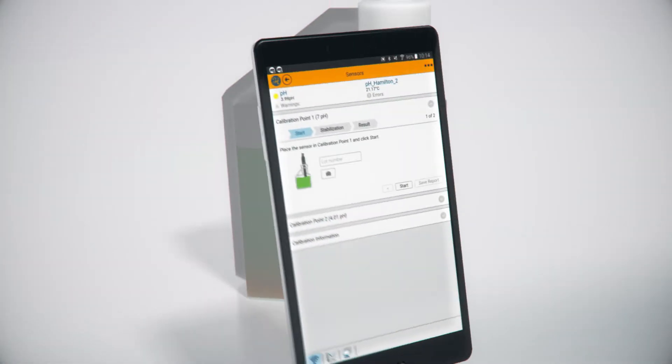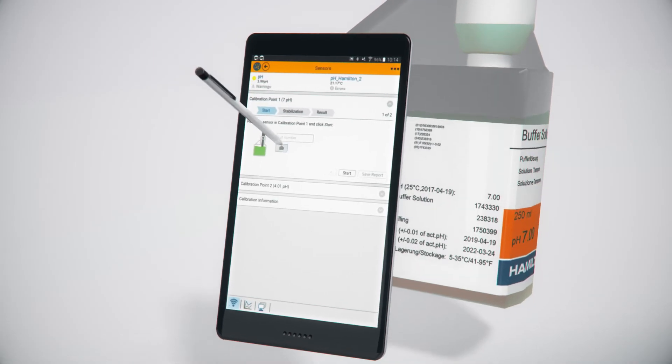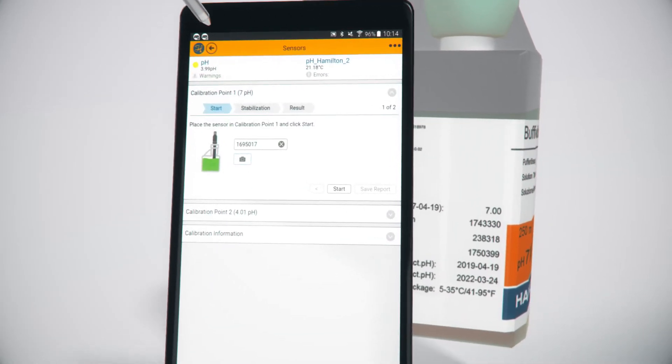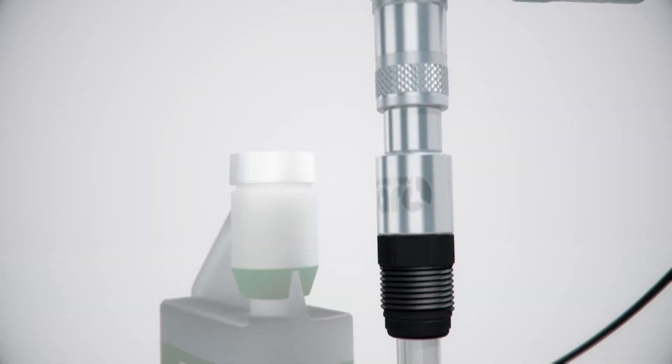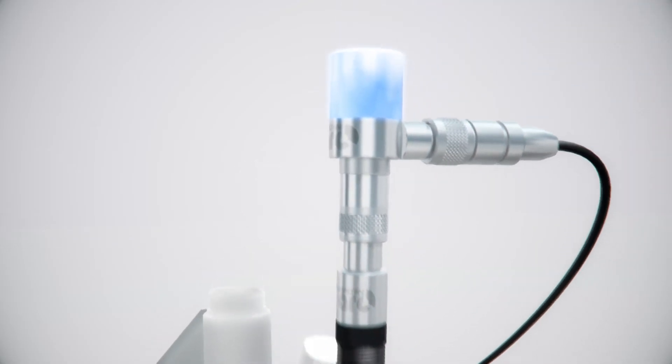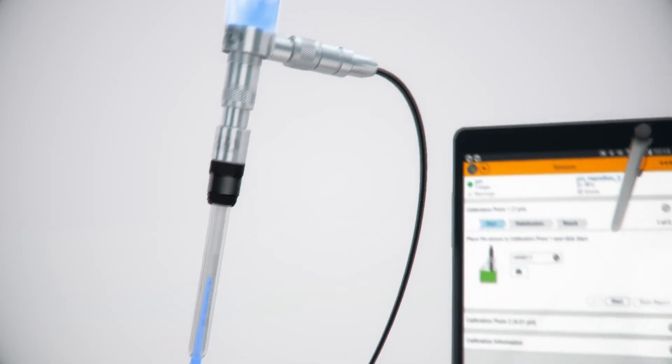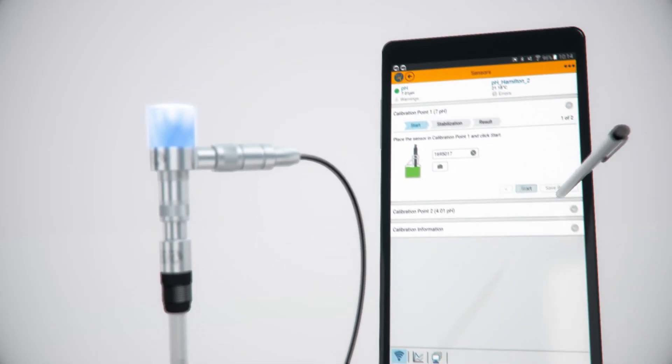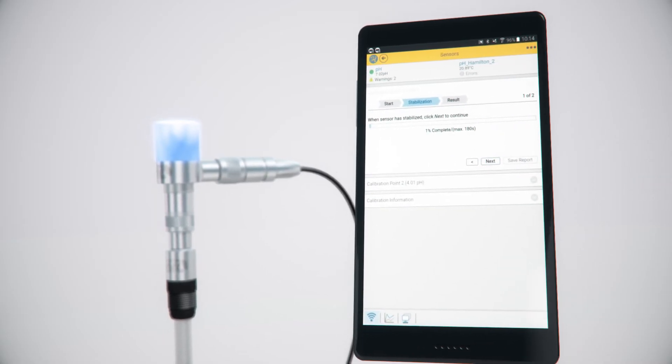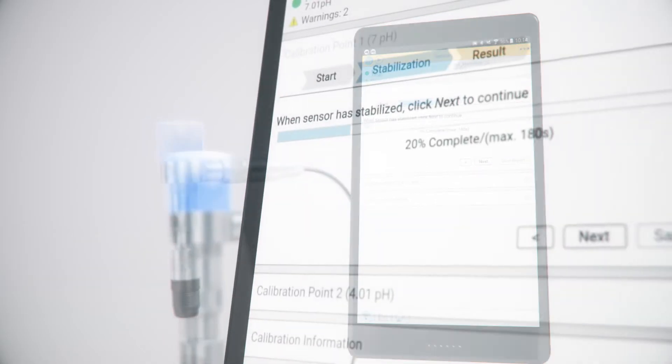Scan calibration buffers with your mobile device to instantly document each lot number. ARC-Air guides simple calibration in the lab or at the line, while automatically documenting sensor status and maintenance tasks.